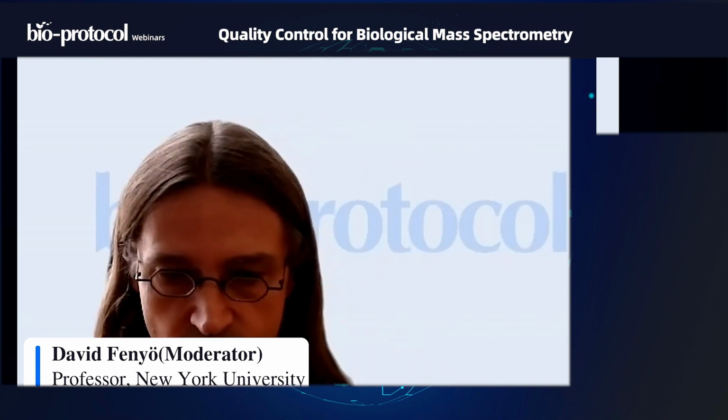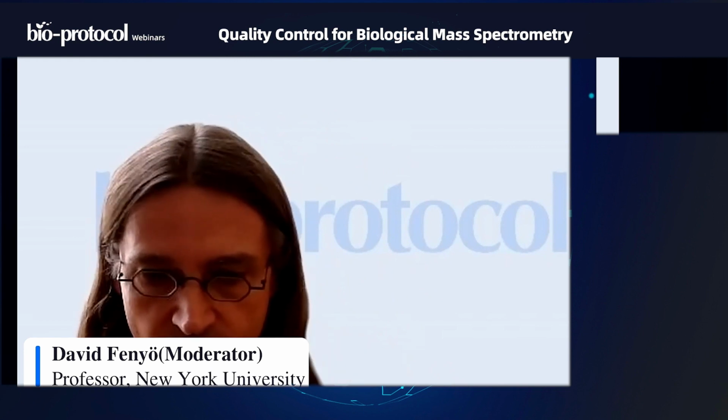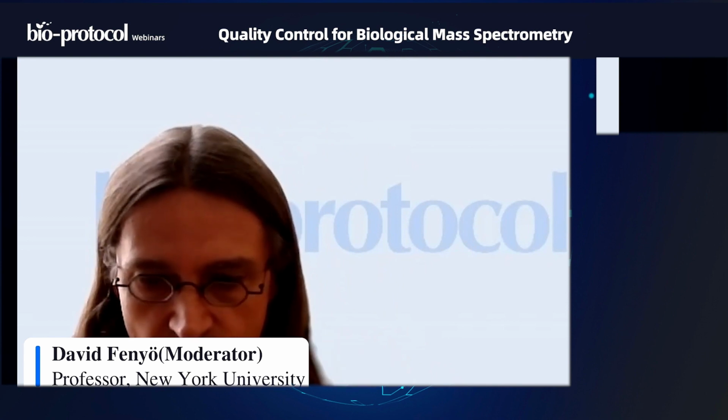Maybe let's start with this. There's 2 questions in the Q&A. So let's start with the first: I have soil metabolome samples collected in batches. I'm planning to analyze immediately as they're collected because the number of injections are large. In this case, what could be the best QC approach?